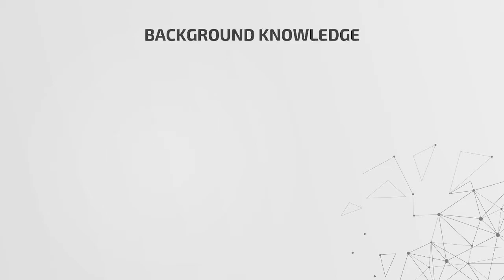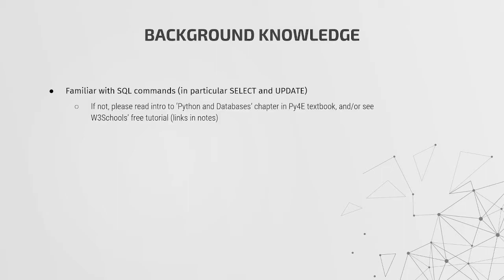There is some background knowledge required for this presentation though. Firstly, it's assumed that you're at least familiar with SQL commands. If you're not, I suggest that you read the Python and Databases chapter in the Py4E textbook, and I'd also recommend the W3 School's free SQL tutorials. I'll put some links in the notes for those.